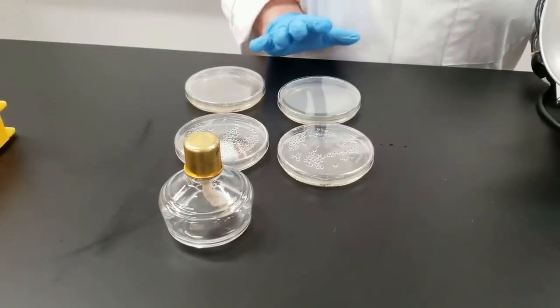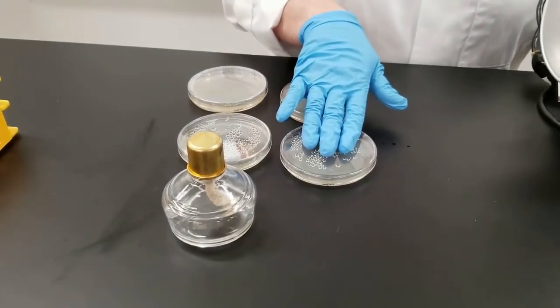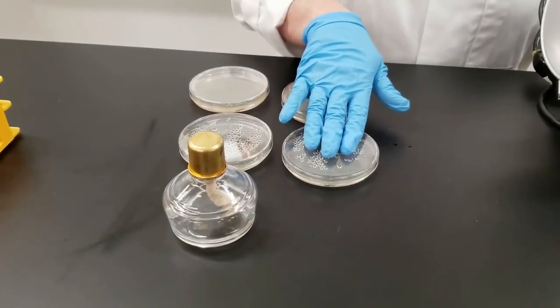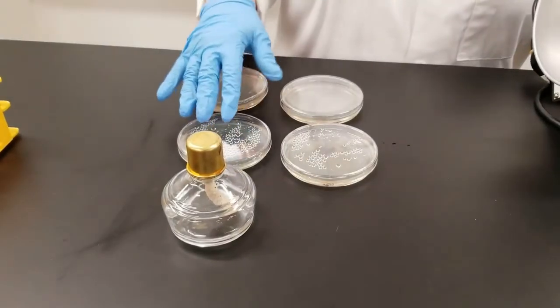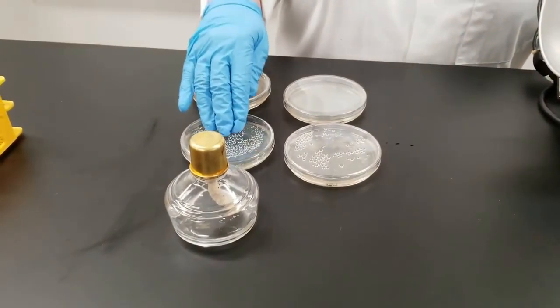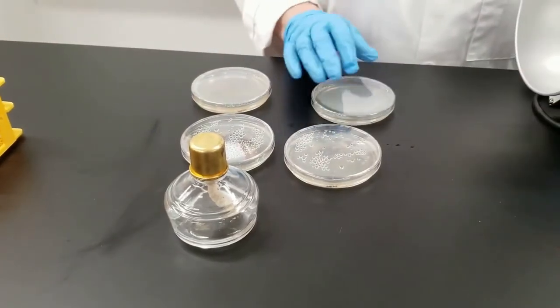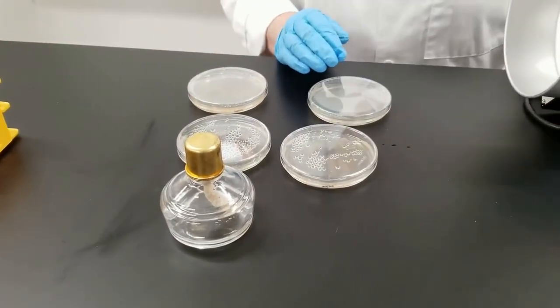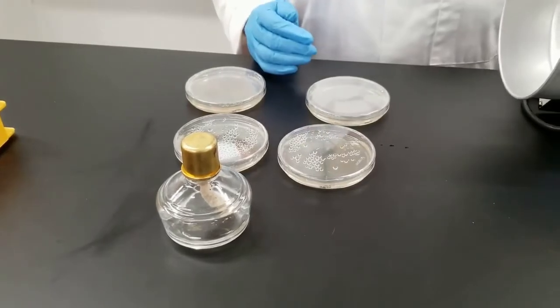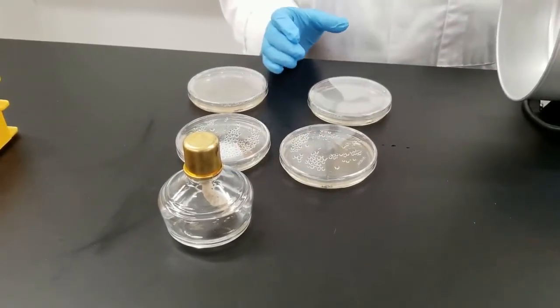Okay, so now that our plates are inoculated, the first plate is our control, so that will not be exposed at all to the UV light. We're going to start with the different time periods. We have 5 minutes, 10 minutes, and 30 minutes. Plastic does inhibit the UV waves, so we need to take the lid off of the plate when we go to do this.